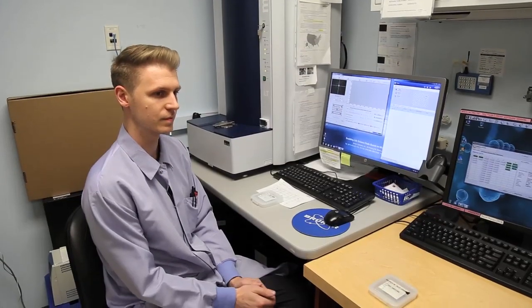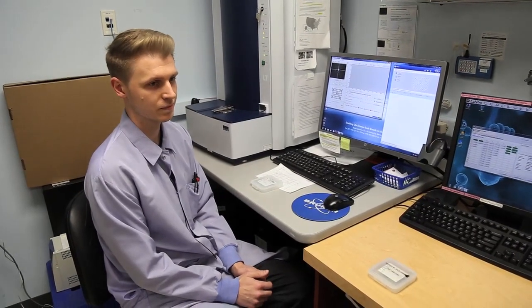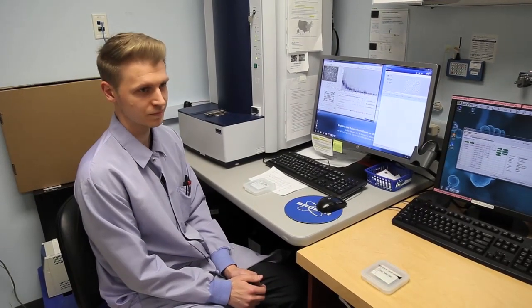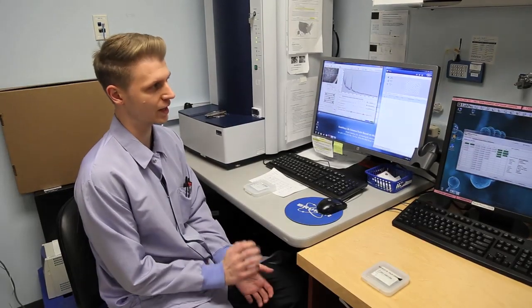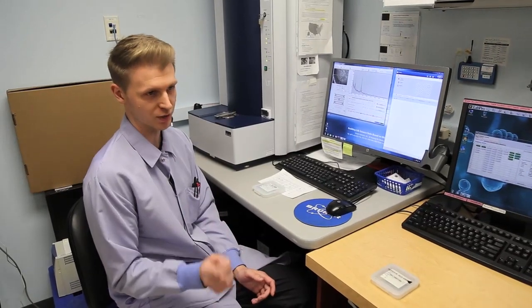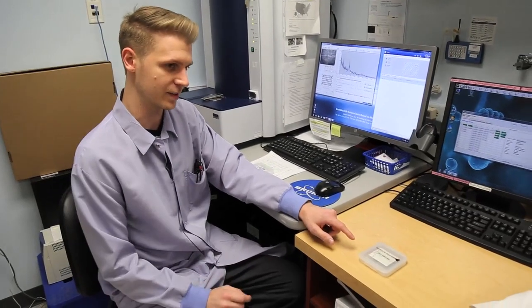So when you say direct colony, do you mean you can actually take a sample from a plate, let's say, that's growing? Yeah, exactly. And then you test it on this? Okay. So what does that entail? How do you do that? So we have to get a good colony of growth, and then we'll take a small toothpick, take a little bit of our colony, and smear it on one of these plates.